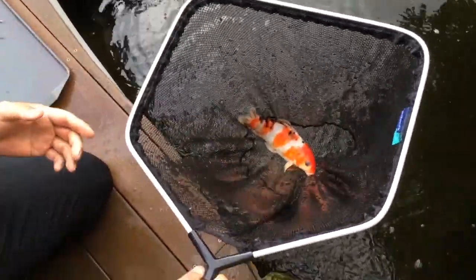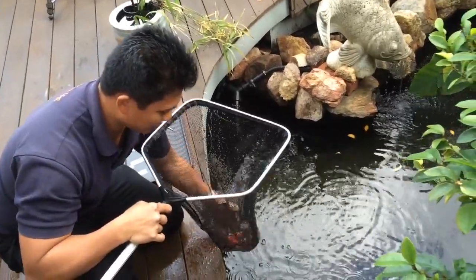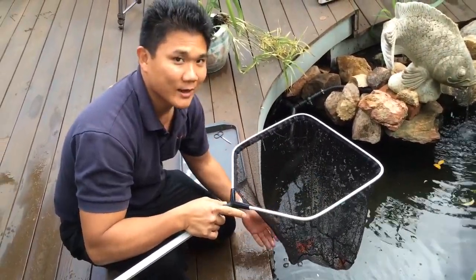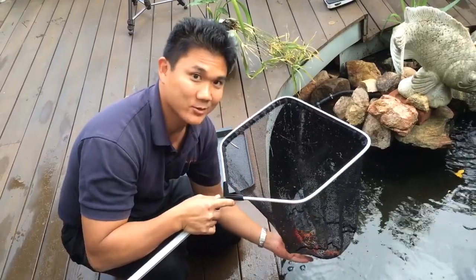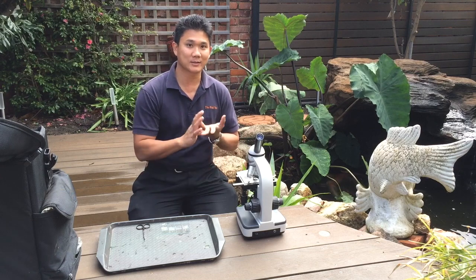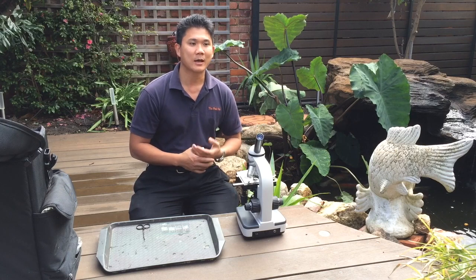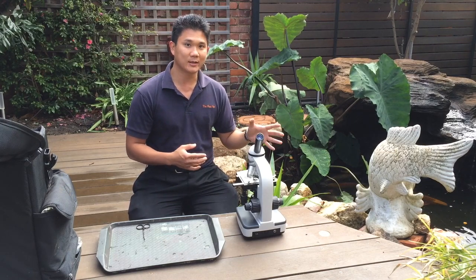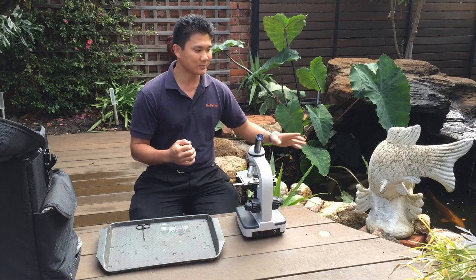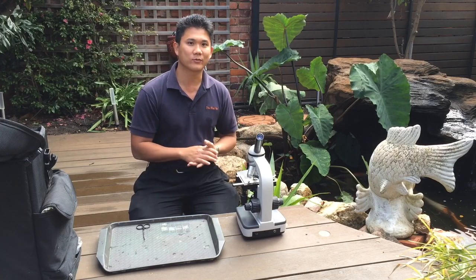With anything I do, I'm always testing a minimum of three fish — that way you get a good idea of what's happening in the pond. If I don't find anything but the fish are still dying, I'll go up to 10 fish, and by then you should be able to gauge what's going on. So we've finished the sampling of the fish, checking on the gill and skin health, and I can say that we've successfully eradicated the pathogens from the previous visit. But now what we're dealing with is trichodina. Trichodina is not a primary fish pathogen — it is an opportunist — and basically means we need to clean up the organic matter in the pond and in the filters, and possibly treat with formalin.